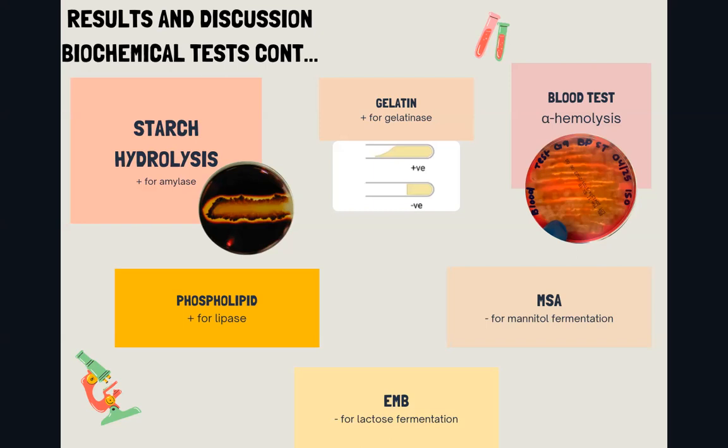The next test was the phospholipid test using the egg yolk agar plates. And our isolate had a slight clearing around it, which indicates that it's positive for lipase to break down the phospholipids in the egg yolk.